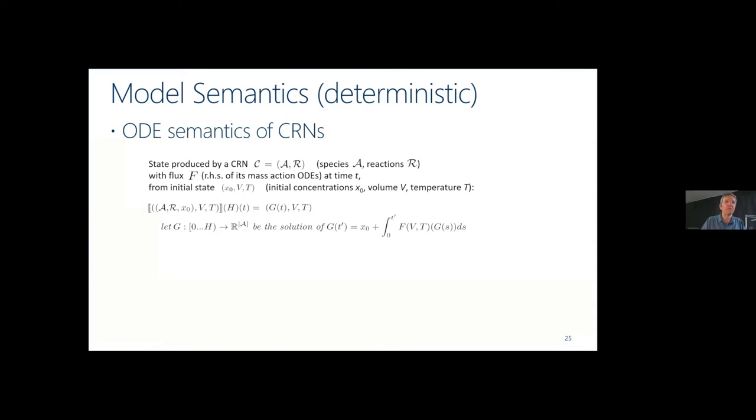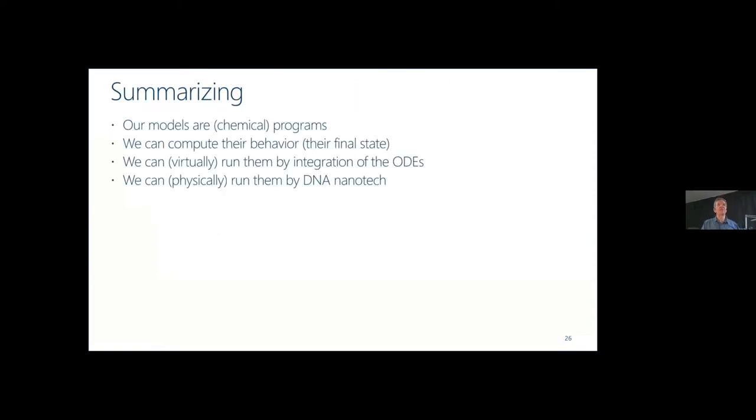Means these concentrations. So summarizing this part, our models are chemical programs. We can compute their behavior, meaning we can compute the final state. We can run them virtually through integration of the differential equations, and we can also run them physically, with some experimental caveats, using DNA nanotechnology.